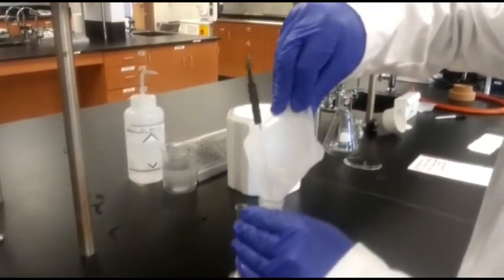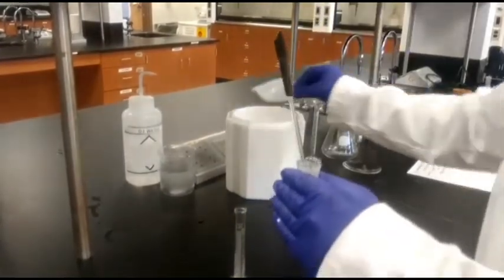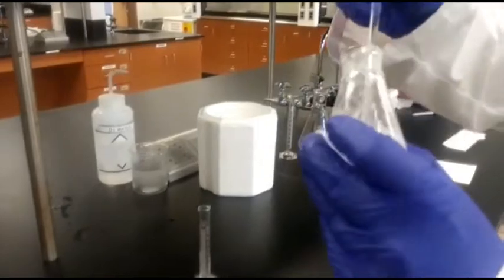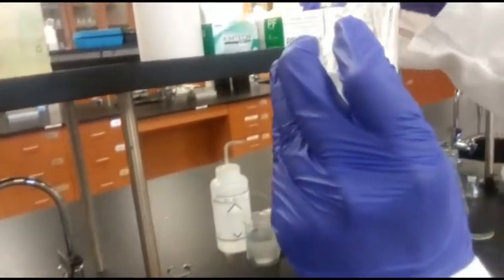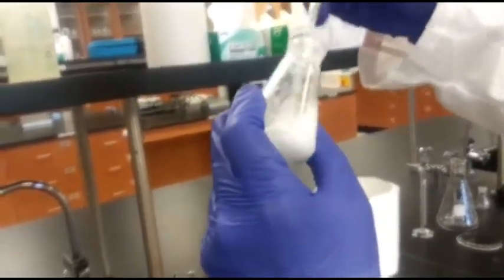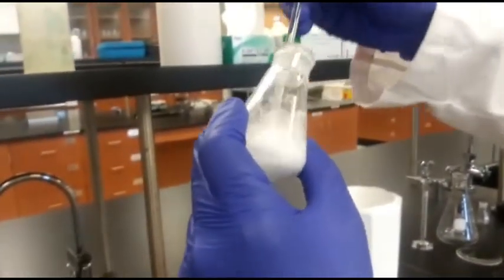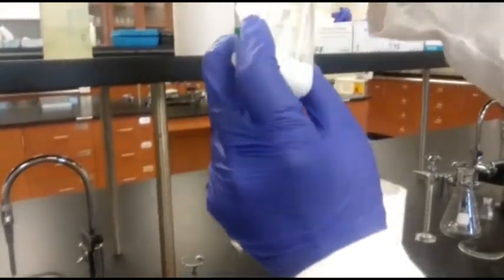reaction mixture, the acetylsalicylic acid that's prepared, and we'll just break this ice so that you will have enough product. A very nice white precipitate is forming here. There we go. This is acetylsalicylic acid.